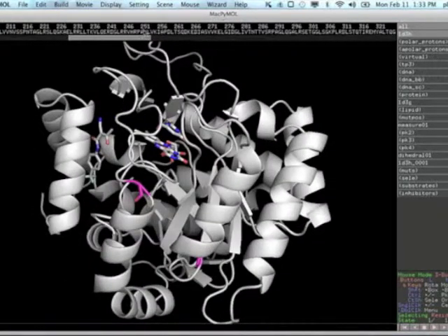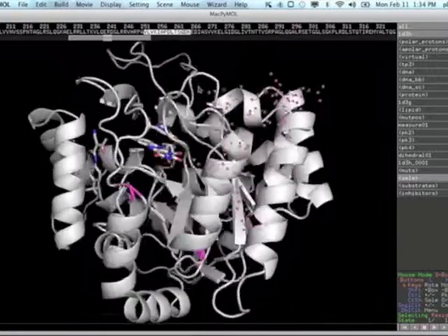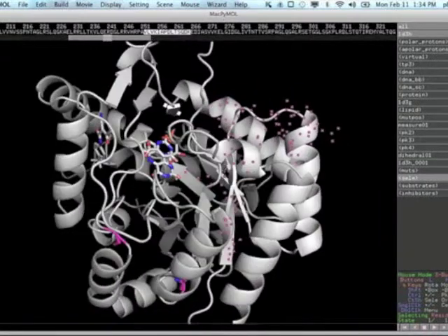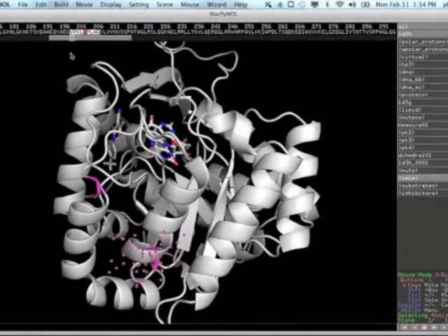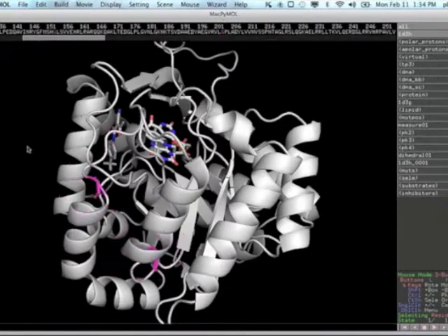And what's neat about this, and all protein viewers, is you can take a stretch in one dimension and see where it falls in the path of the chain in 3 dimensions. And so for instance, we can see in the case of these mutations the regions of the structure where they fall, and we can begin to try and come up with stories about what they might be affecting.